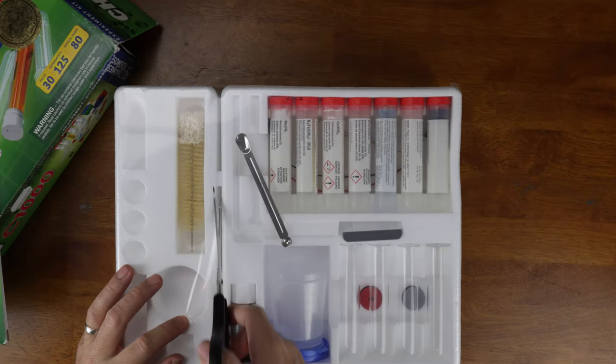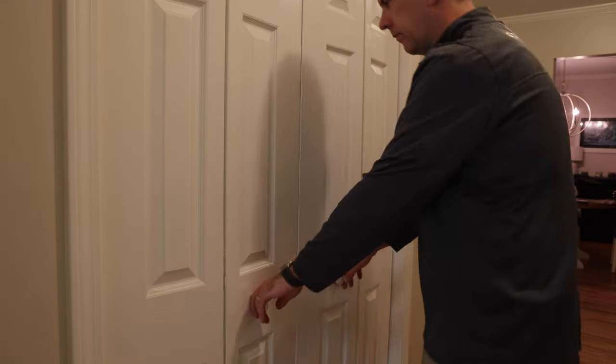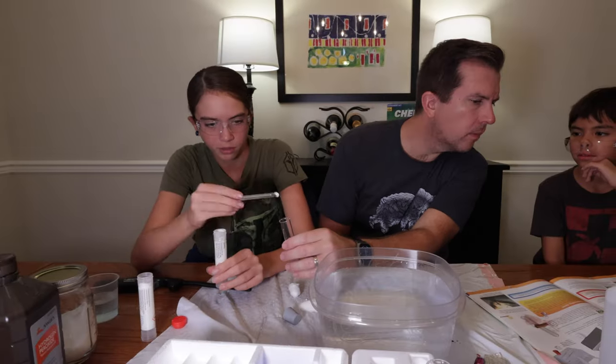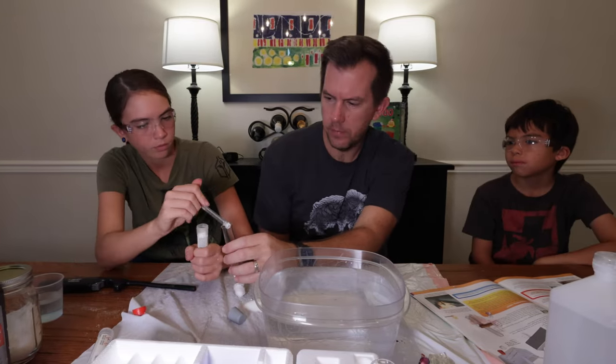My last complaint specific to this kit — and this may be a little petty — is when you open up the kit, you see these huge vials of compounds, but when you actually get to use them you realize they're nowhere near full. It's like when you open up a big bag of Cheetos and realize it's only filled about a third of the way. I kind of want more compounds. There's very little room for error — if you make a mistake, you're quickly going to run out of materials. Also, if you want to repeat these experiments a year or two down the road for younger siblings, these things aren't going to last. It would be nice if they put a little bit more in.